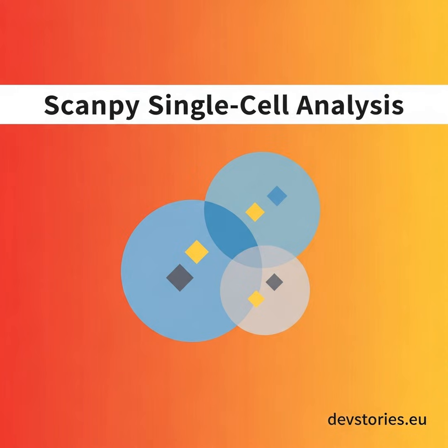Scanpy, Single Cell Analysis, Episode 14 of 16. Just because two cell clusters sit next to each other on a UMAP plot does not mean they are biologically related. Visual proximity in two dimensions is often a mathematical illusion, and if you rely on it to draw developmental trajectories, you might connect dots that do not actually touch in high-dimensional space. To map actual, statistically backed connectivity, you need abstracted graphs with PAGA.